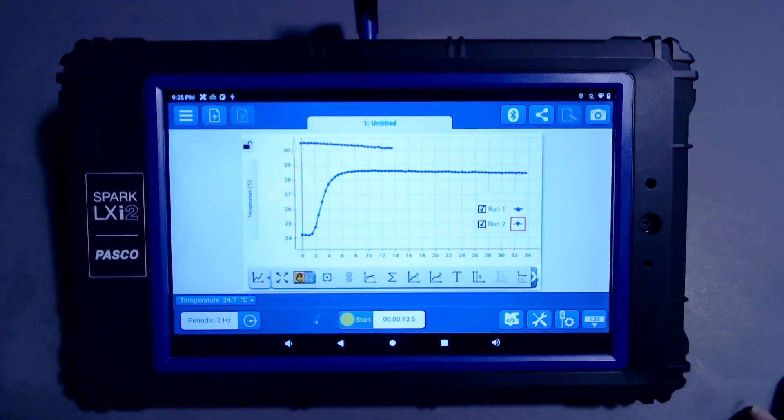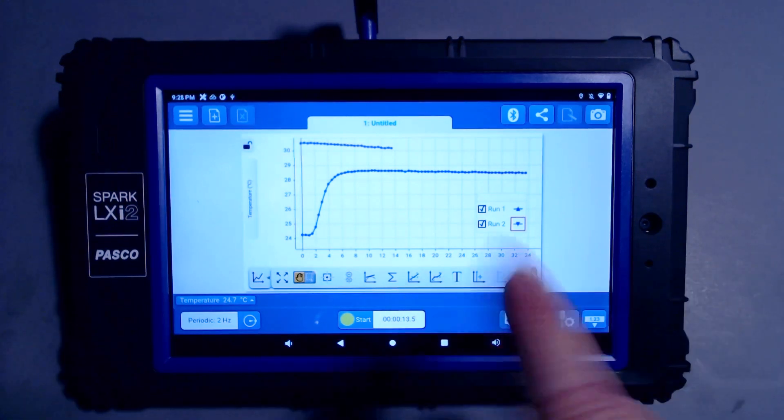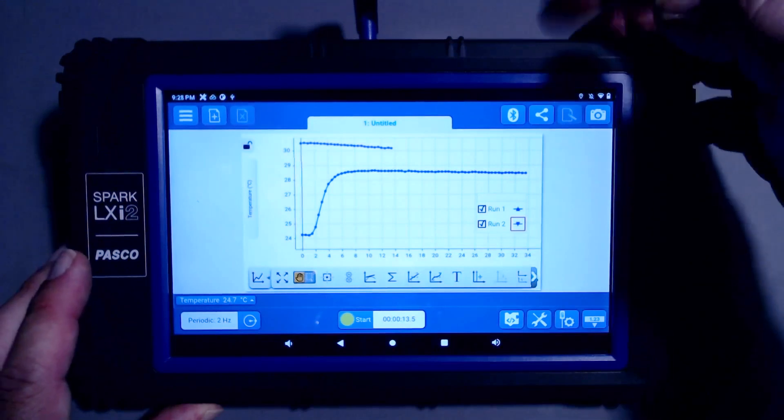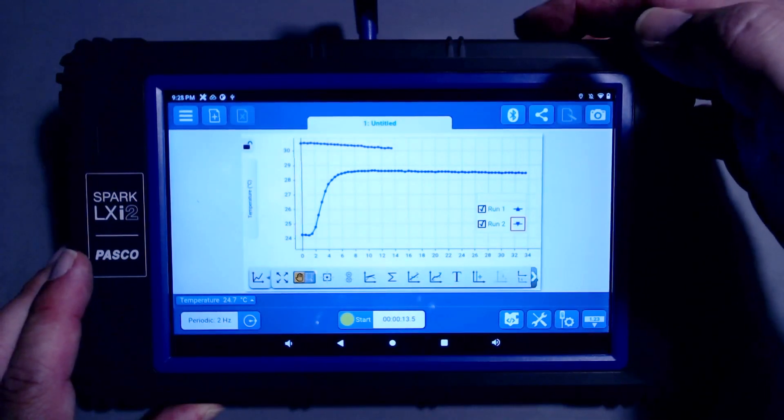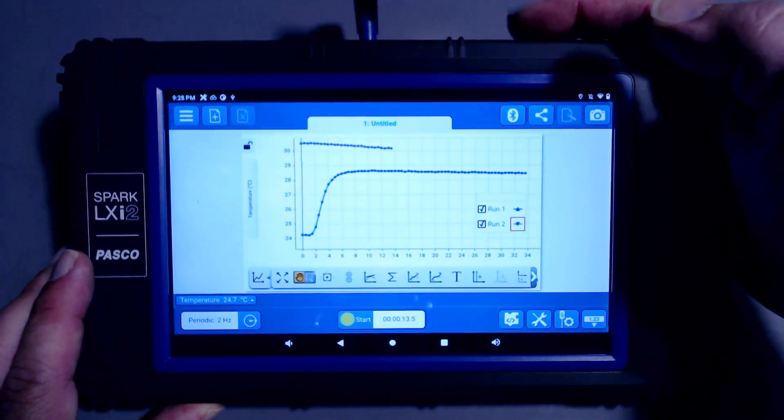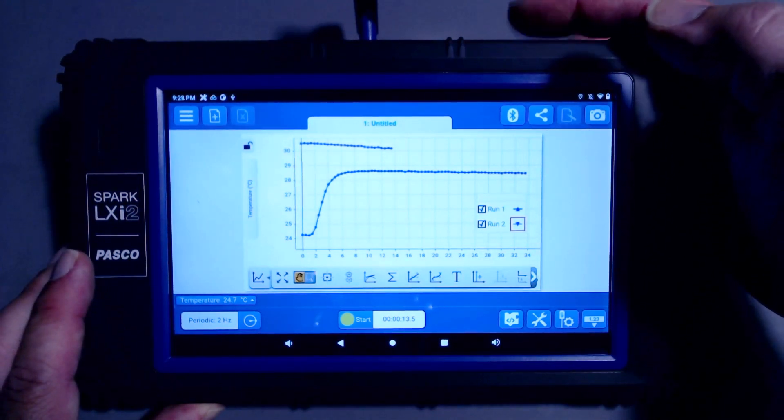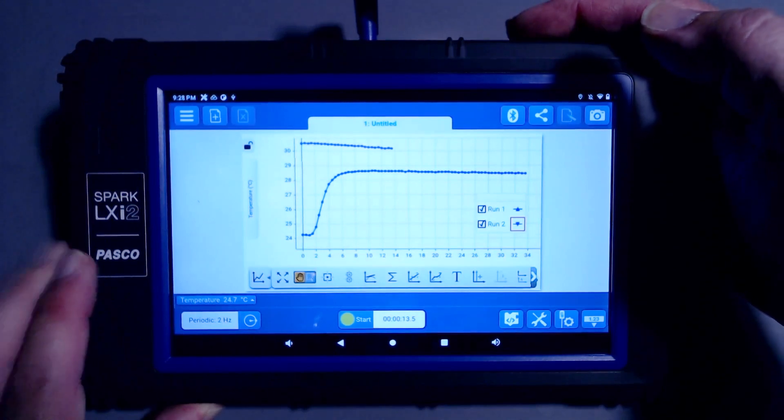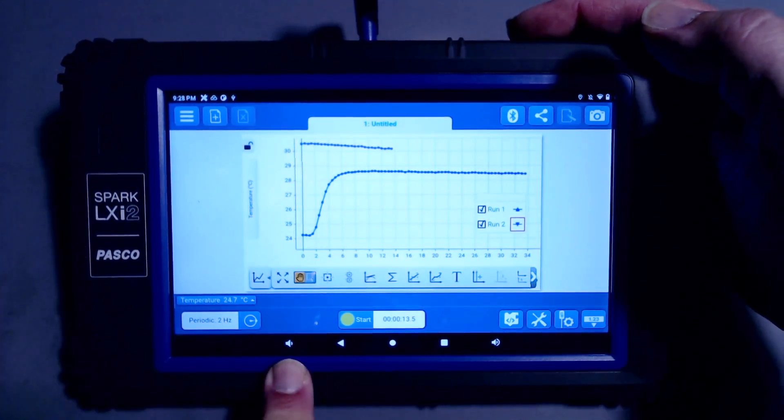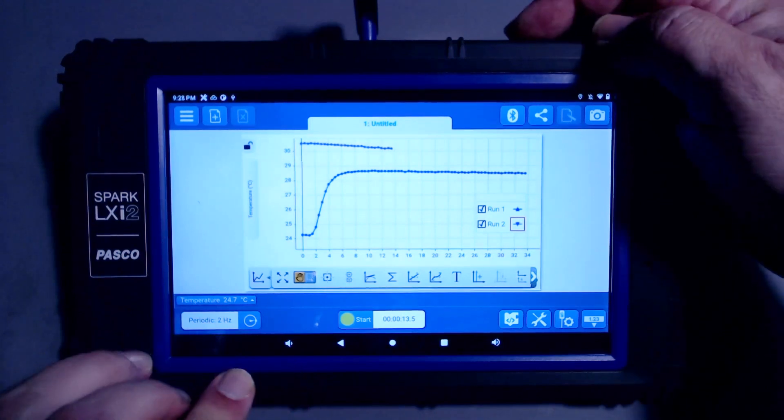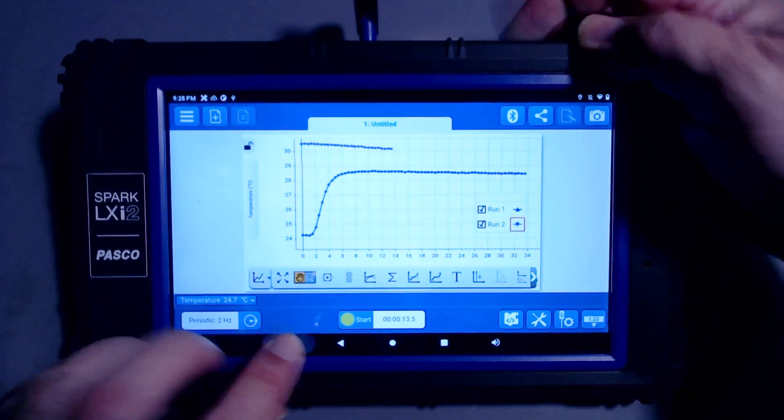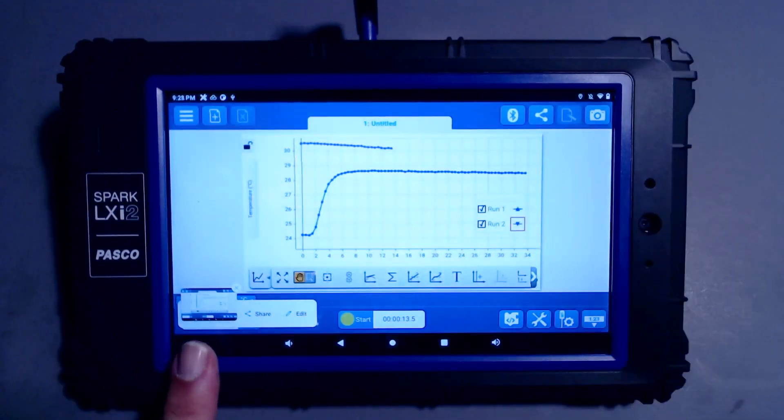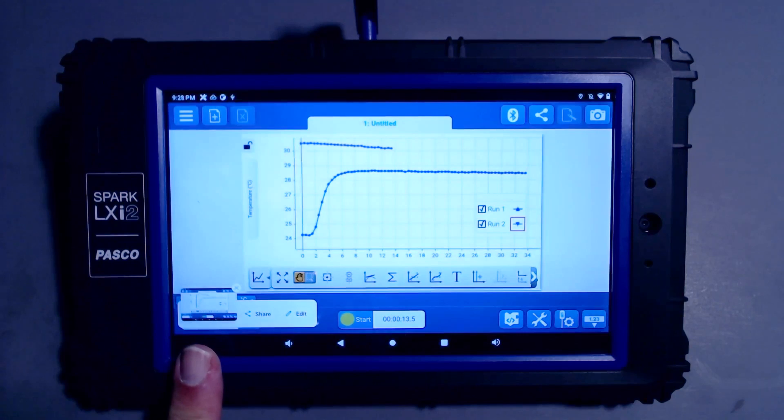I'll begin by capturing a screenshot of the current screen. To do this, I'll need to tap two buttons simultaneously. One is the physical power button on the top of the LX-i2, and the other is the virtual volume down button. So I'll try to tap these buttons at the same time. You saw the flash, and this has taken a screenshot.